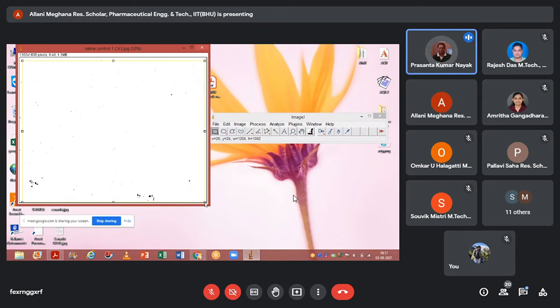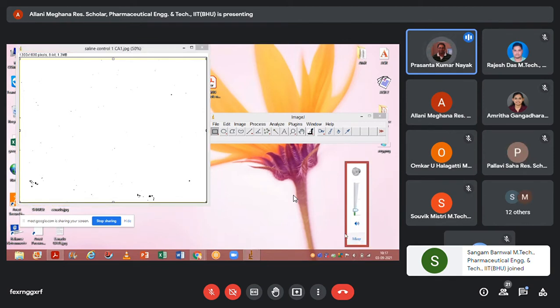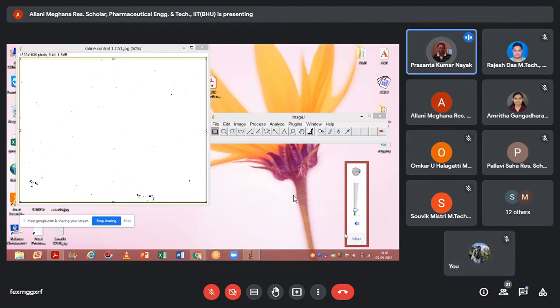Because all the images posted here are of the same size, you need not worry about the extra information. It will bring all the information similar because the size is the same for all images, because while taking the images that was set. So you have to select the whole thing, and now you do the rest of what you did.